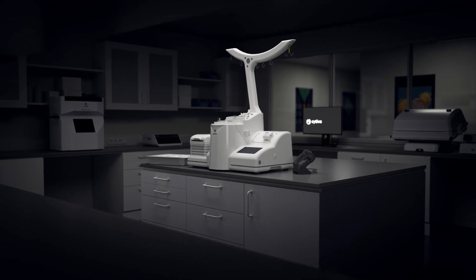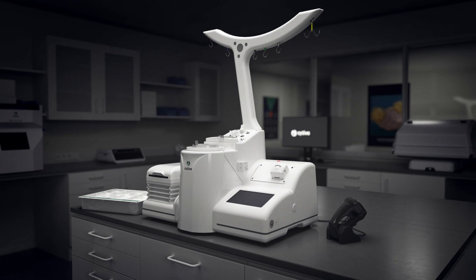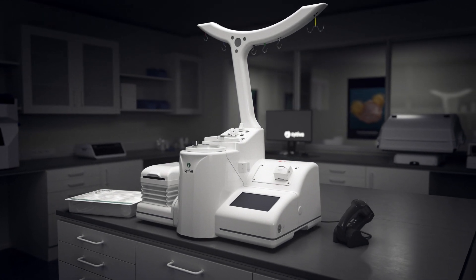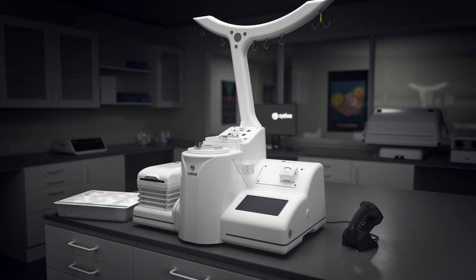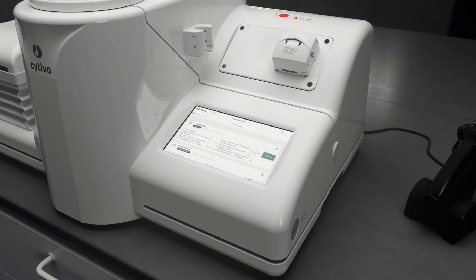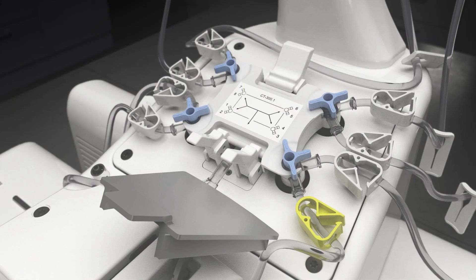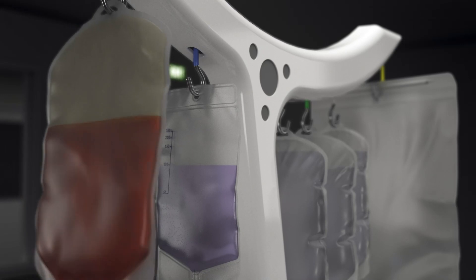The Sephia cell processing system is a multi-functional, fully automated, and functionally closed platform for cell therapy product manufacturing. The system includes the instrument, application software, and single-use kits, and lets you flexibly combine multiple upstream or downstream processing steps.